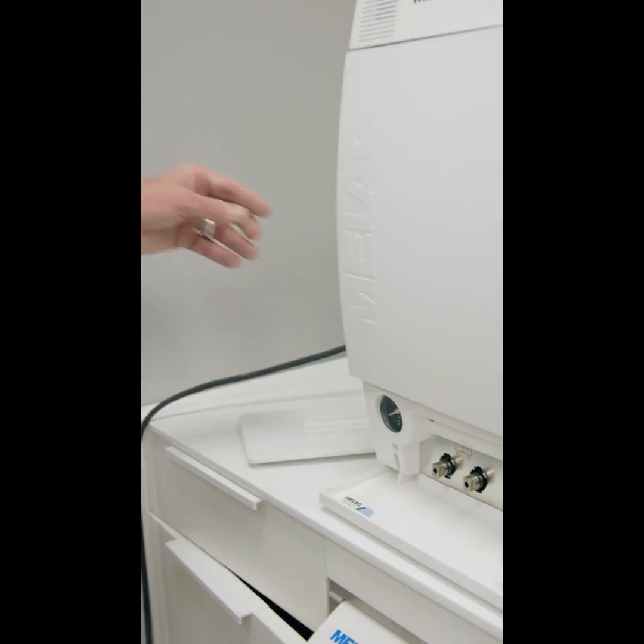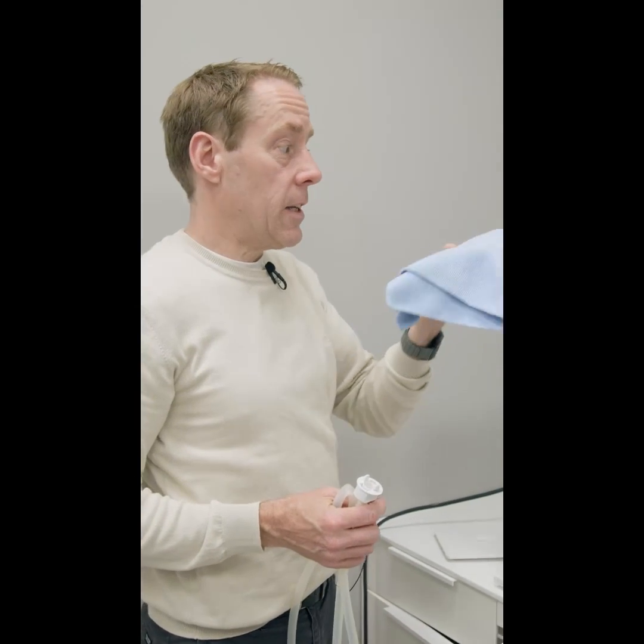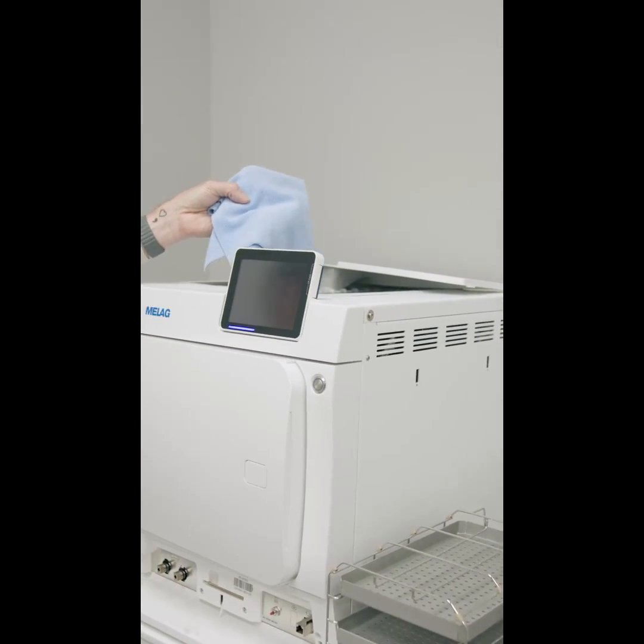Once that's done, you would then get a non-linting cloth such as this and make sure those inner chambers are then dried.